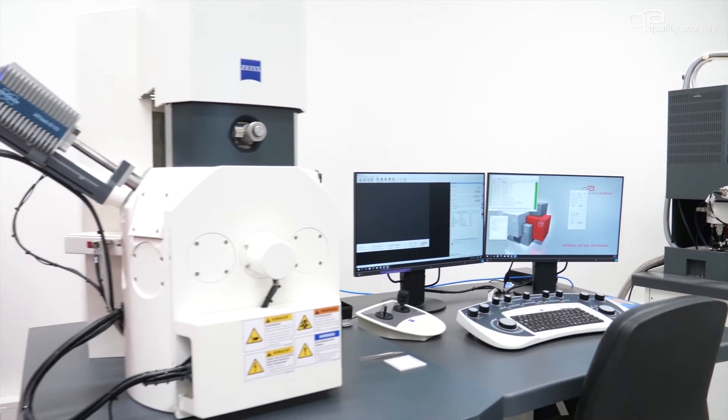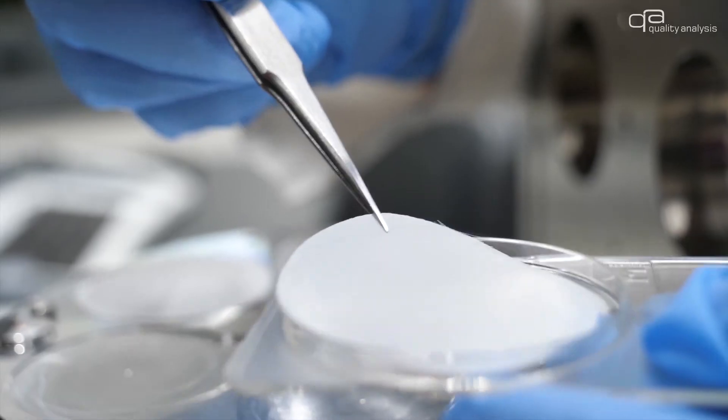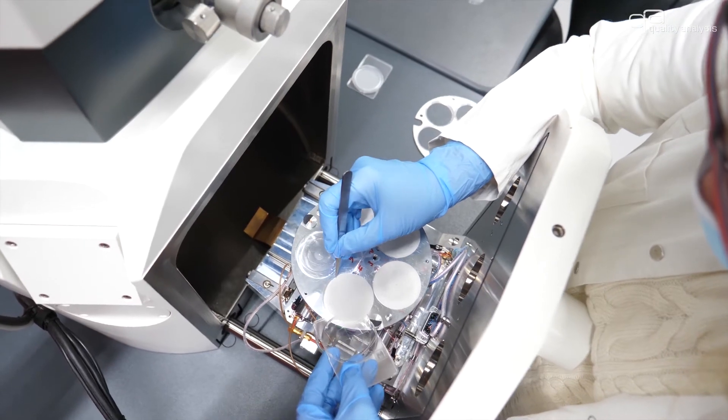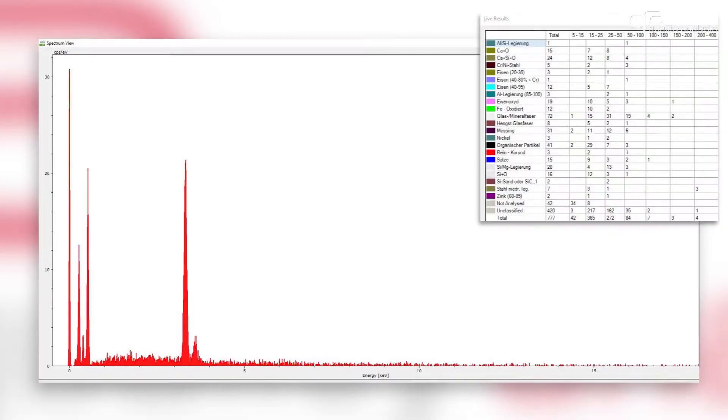Further analysis on the harmfulness of the particles can be carried out subsequently. To identify metallic and mineral particles we use the fully automated scanning electron microscopy with EDX.